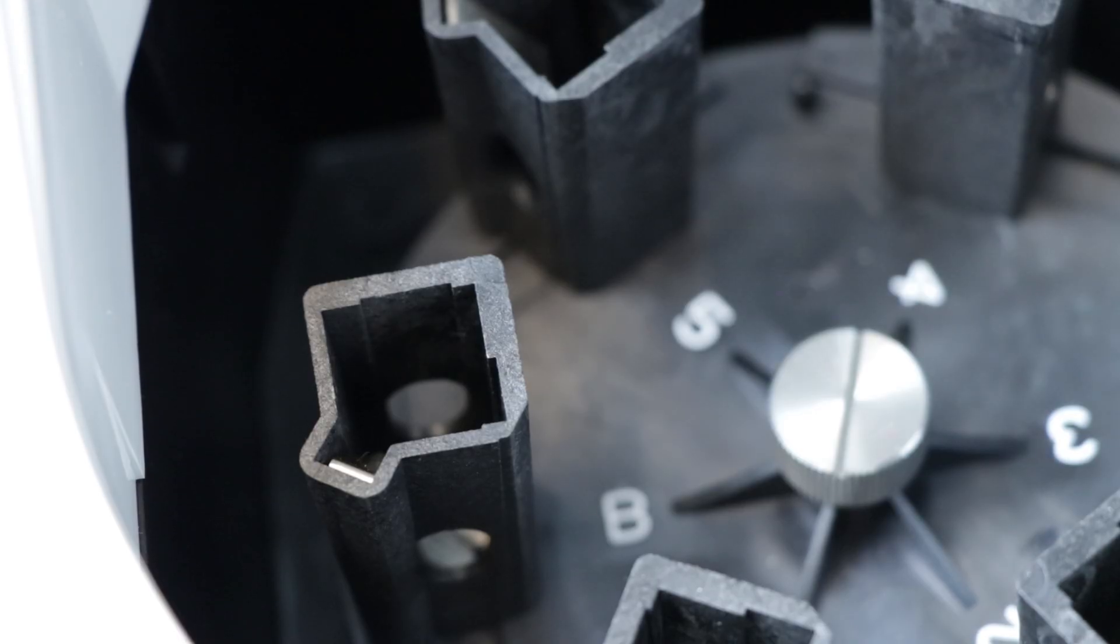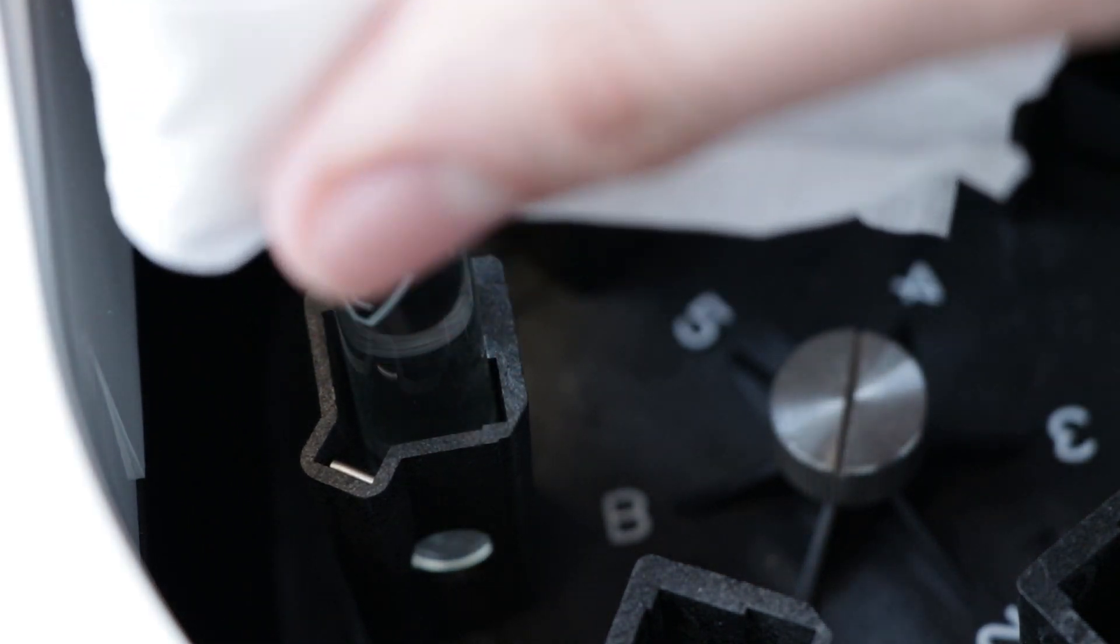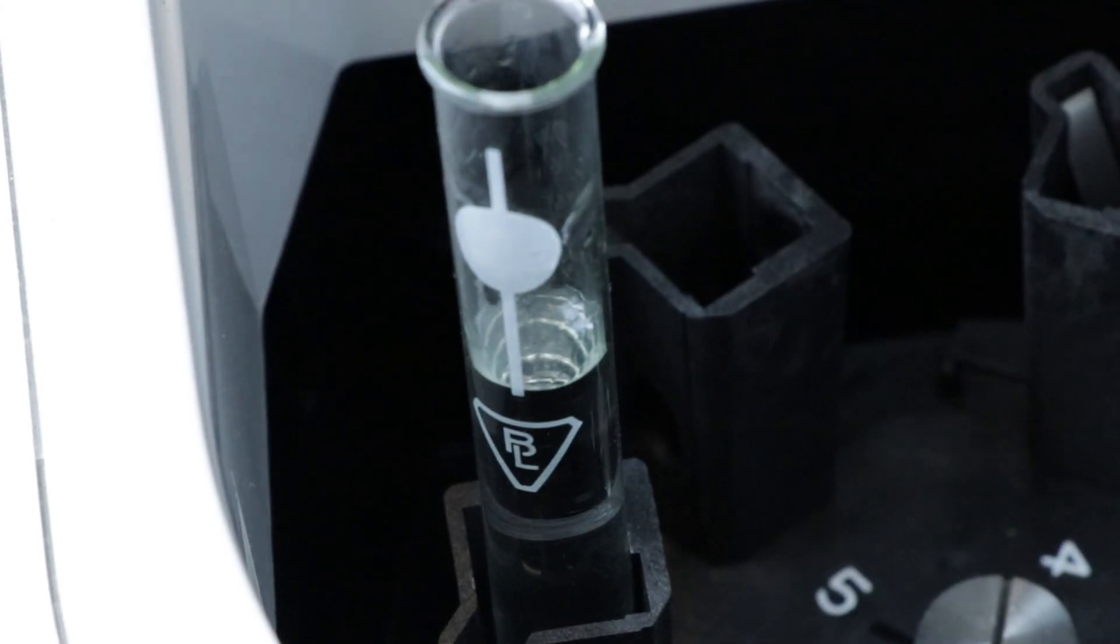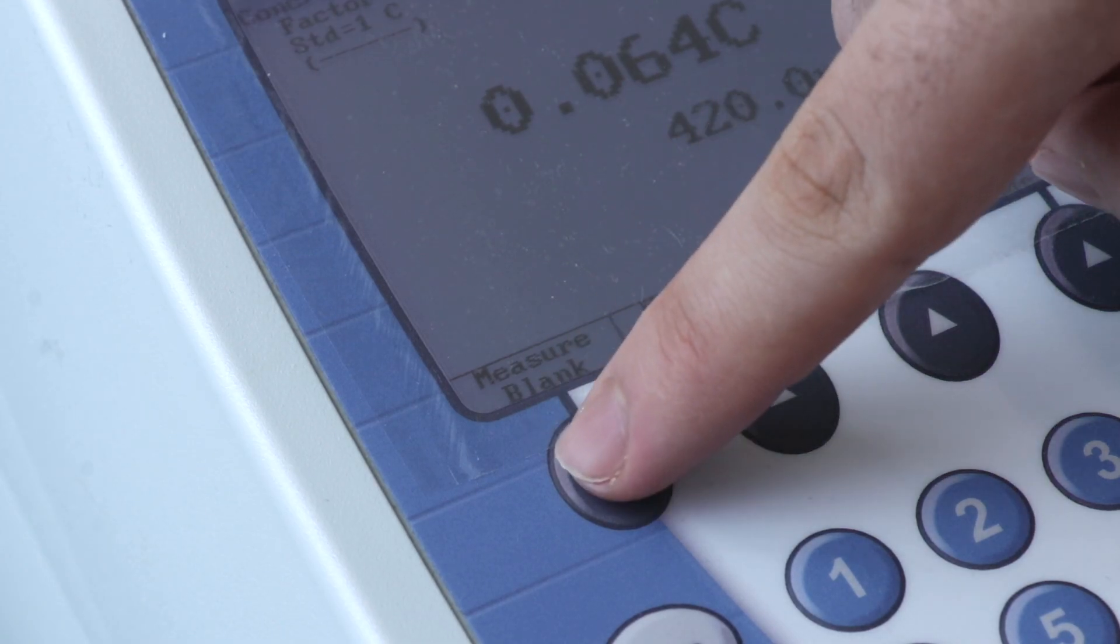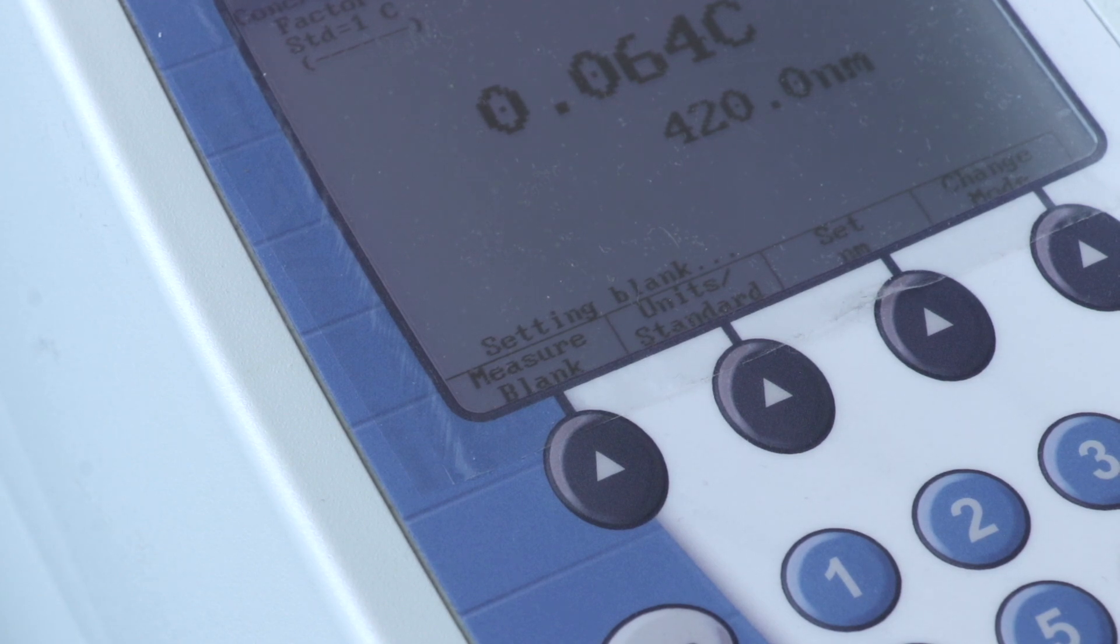To calibrate the spectrophotometer, insert the blank into position B. Wipe the cuvette with a Kimwipe to ensure that there is no liquid or fingerprints on the outside that may influence the absorbance. Then, press the measure blank button for calibration. This will set the blank at 0% absorbance and 100% transmittance.